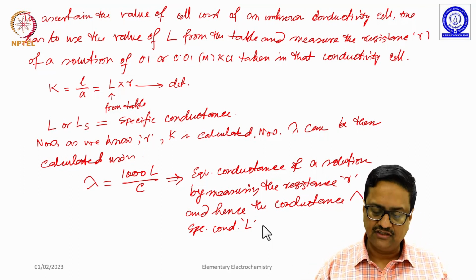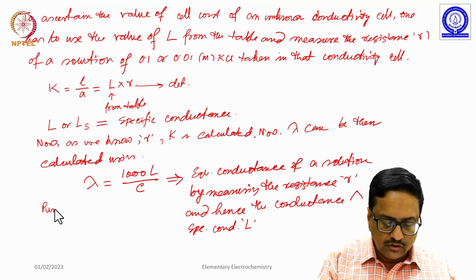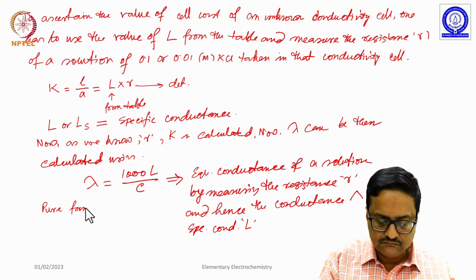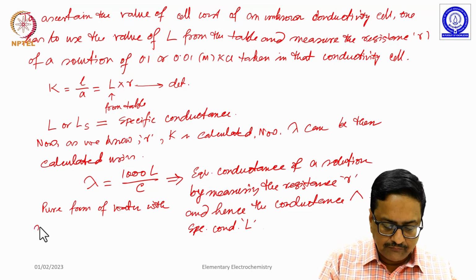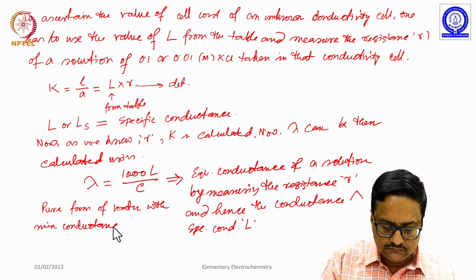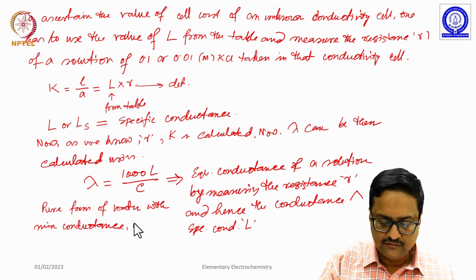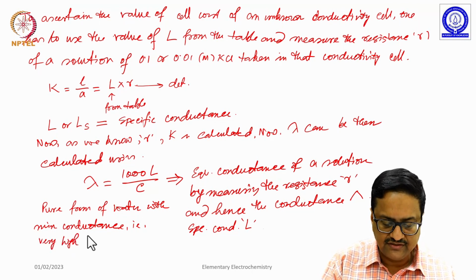So now when we are trying to measure the conductance of a solution and we are using water as a solvent, one has to use a very pure form of water with minimum conductance, that is very high resistance.